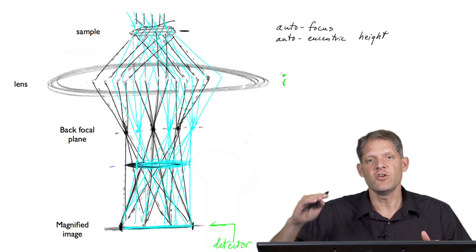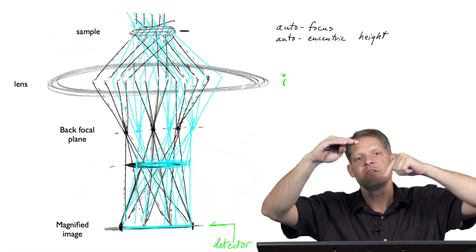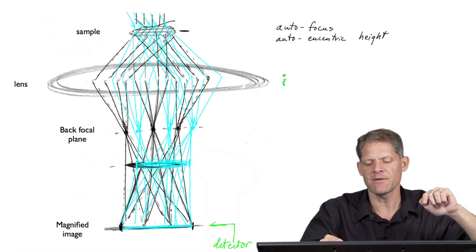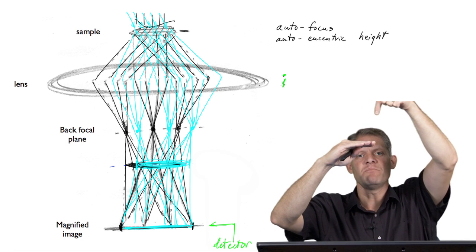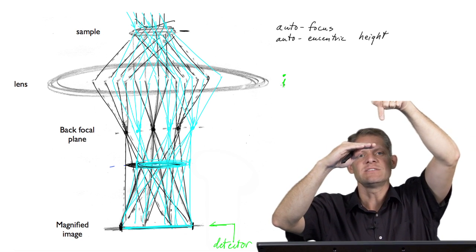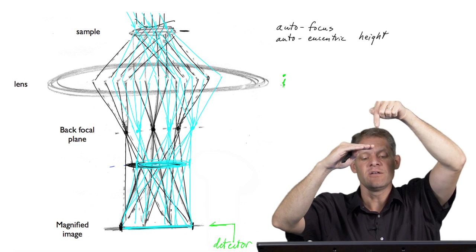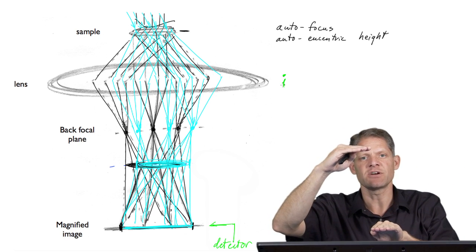Then when you insert a new sample into the microscope, you can set the current of the objective lens to this known current I. And then you can start wobbling the beam tilt and simply adjust the specimen height until the movement of the image is minimized on the detector.